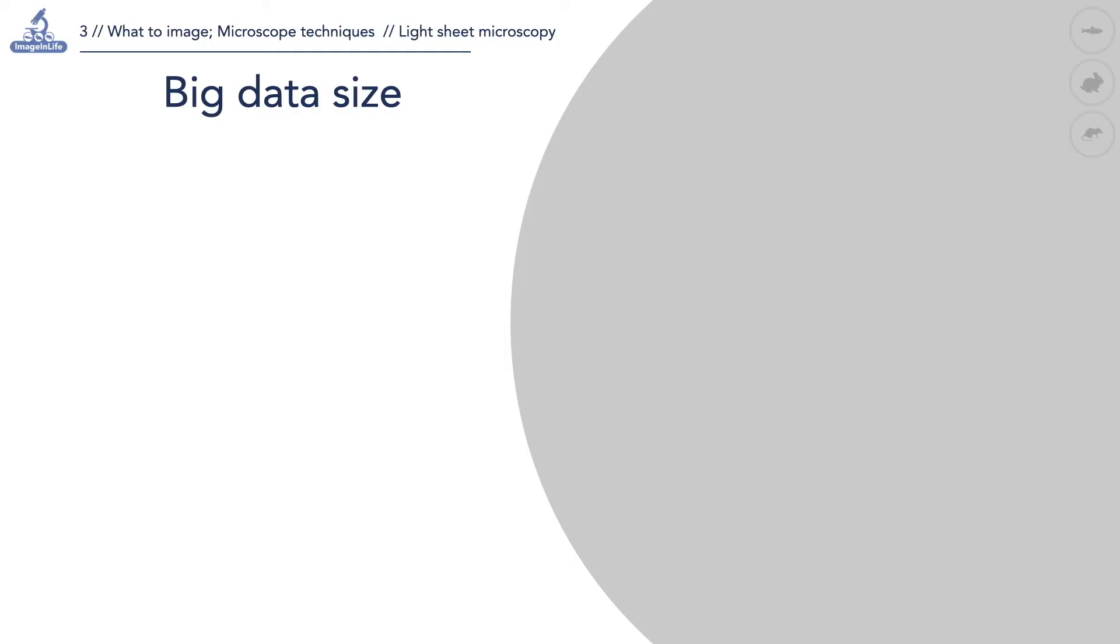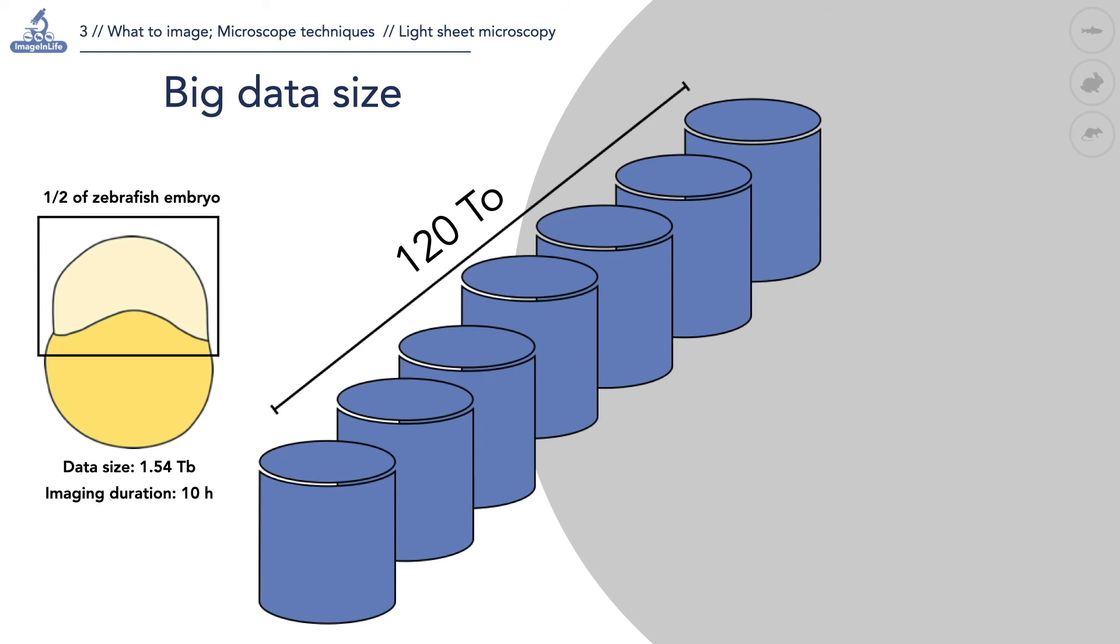Light sheet microscopy generates large amounts of data. For example, to image one half of a developing zebrafish embryo over 10 hours generates 1.5 terabytes of data. In our laboratory, the storage space with a microscope is 120 terabytes. To save compressed data, the management and analysis of light sheet microscopy data requires dedicated IT strategies.